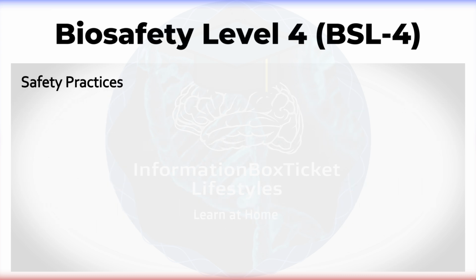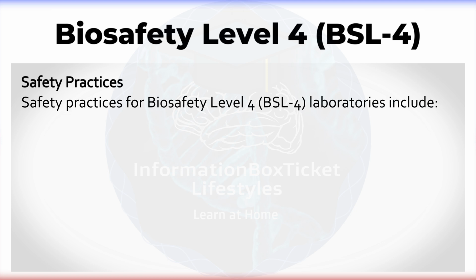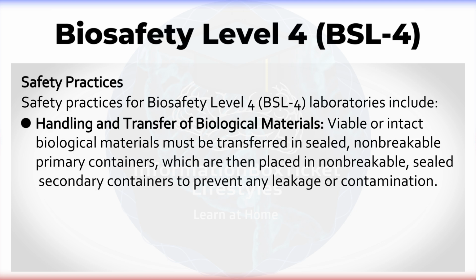Safety practices. Safety practices for Biosafety Level 4 laboratories include handling and transfer of biological materials. Viable or intact biological materials must be transferred in sealed, non-breakable primary containers, which are then placed in non-breakable sealed secondary containers to prevent any leakage or contamination.